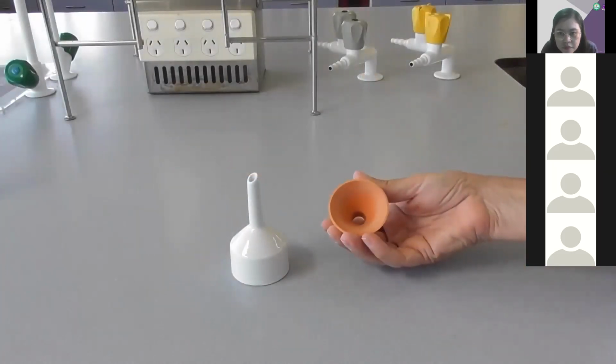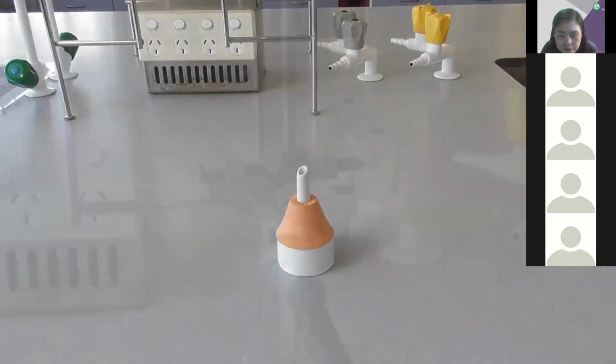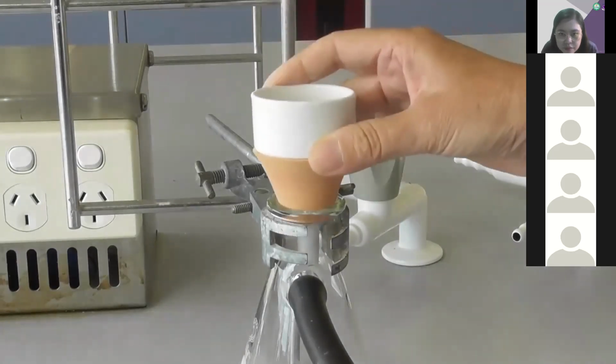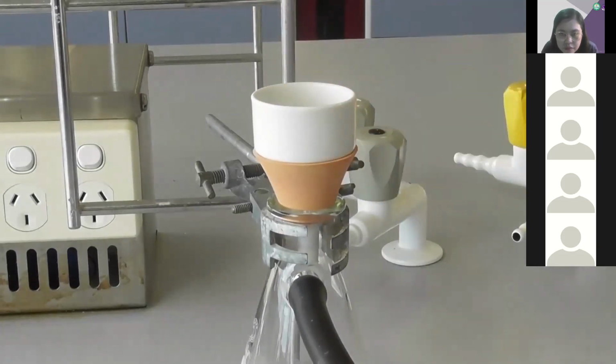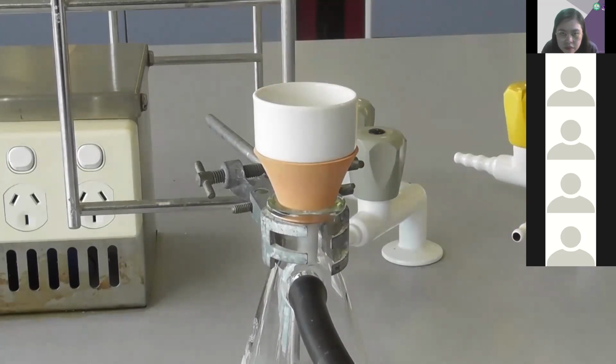To create a vacuum seal with a Büchner flask, you must fit a rubber cone to the bottom of the Büchner funnel. Insert the Büchner funnel into the mouth of the Büchner flask. This fit may initially be loose, but as the vacuum is applied, the seal will form. Add the correct size filter paper.